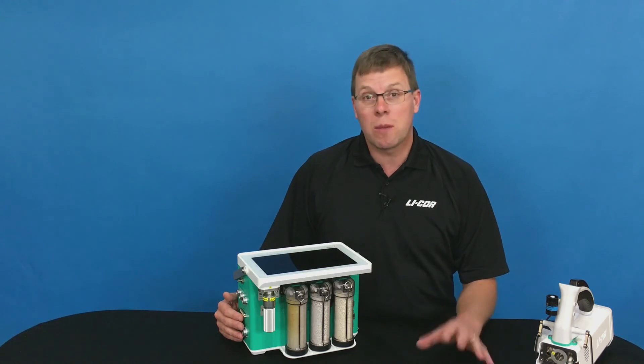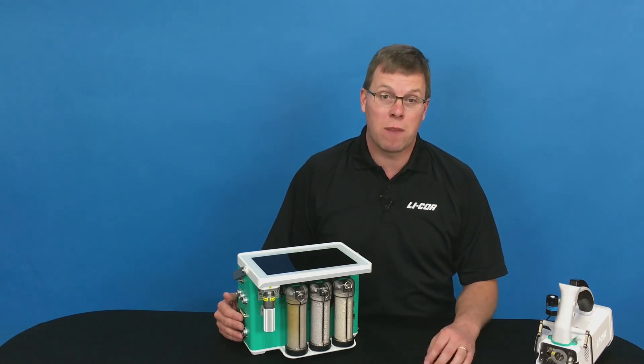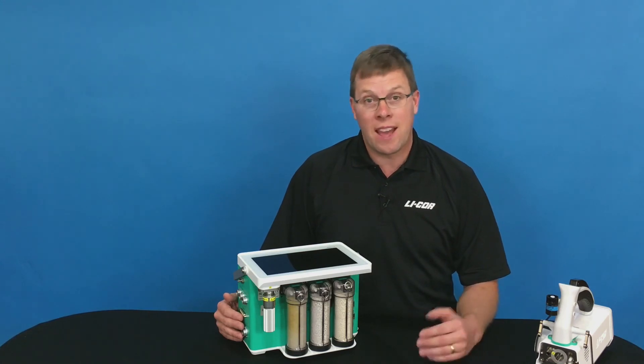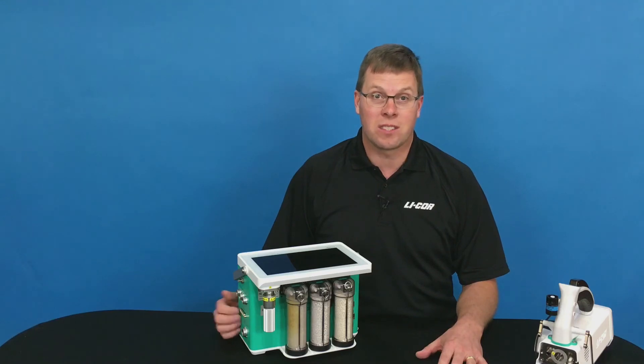This is just some of the maintenance of the 6800. More details can be found in the user manual or on the website. And as always, you can contact LI-COR technical support for additional information on the system.